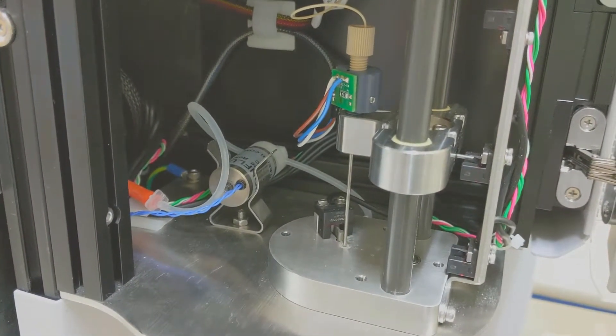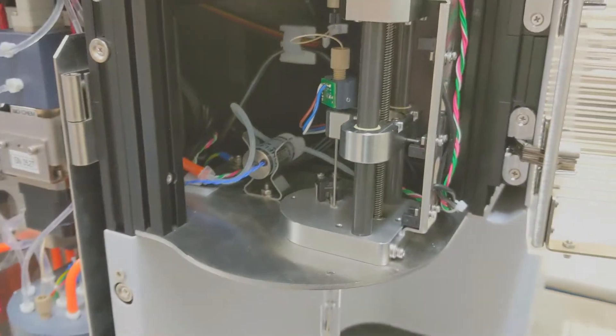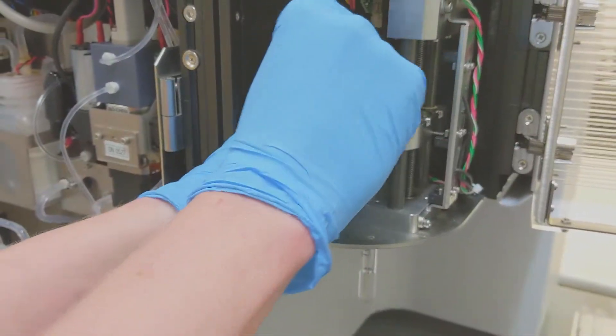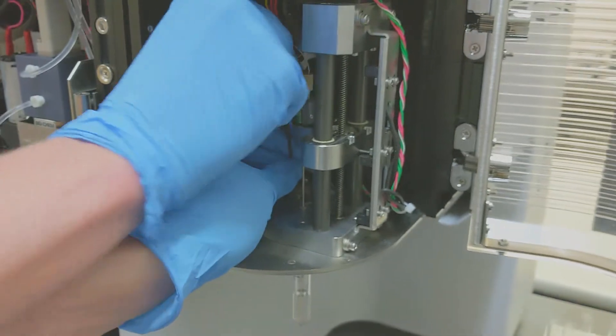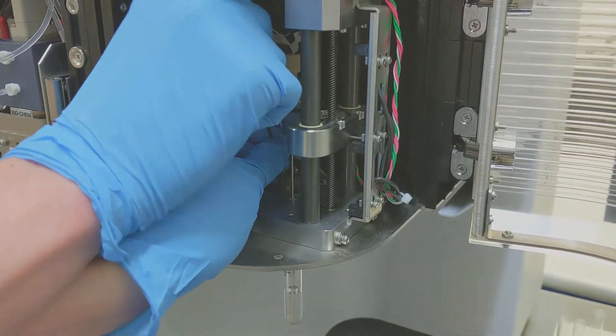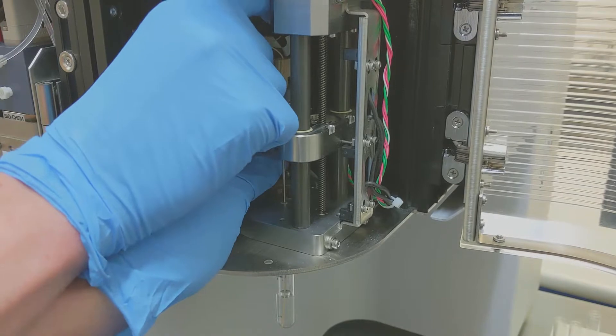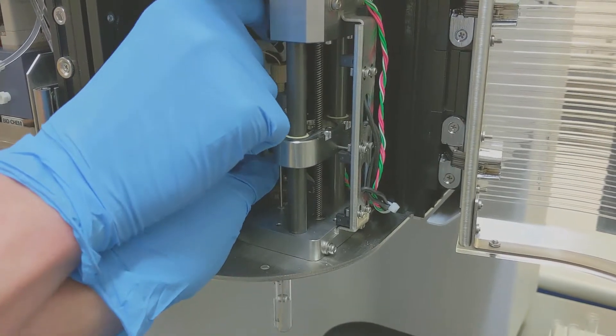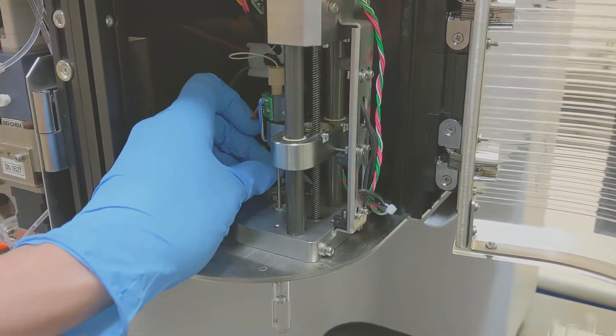Let's go ahead and grab our metric Allen wrench size M1. I'll go in there and loosen up both of these screws. Now be careful while you're working in here not to damage the sample line or any of the cable wires that are in this area.